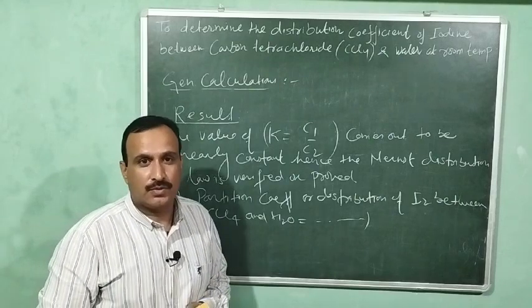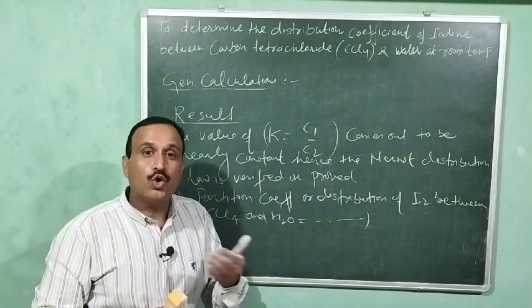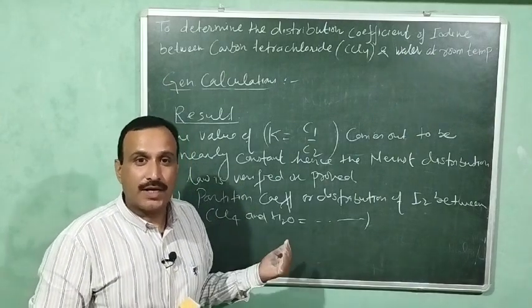Okay, and in those titrations I will explain what is the role of potassium iodide in these titrations.